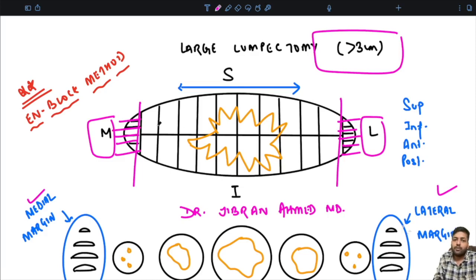Then for example, you see that for this considerable length up to these two areas, you cannot see any tumor. Everything is all right. Starting from this quadrant, 1, 2, 3, 4, 5, 6, you get different sections. So you have basically sliced everything like this till this point, and one perpendicular line like this has also been sliced.